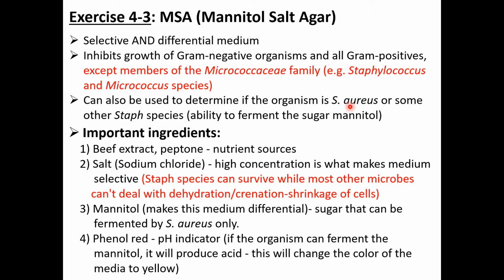Okay, so that's why when we have a differential medium, you have to add ingredients in here that will show you that there is fermentation. So the medium has several nutrient sources, okay? But the selective ingredient will be the salt.